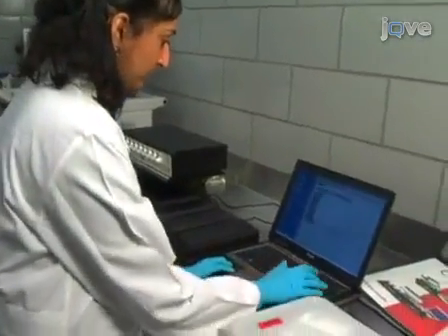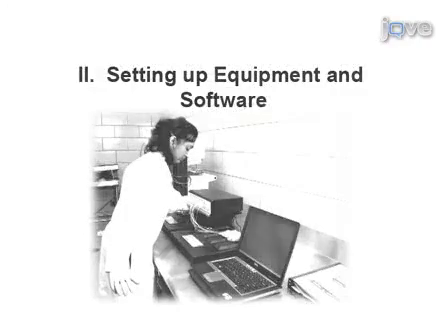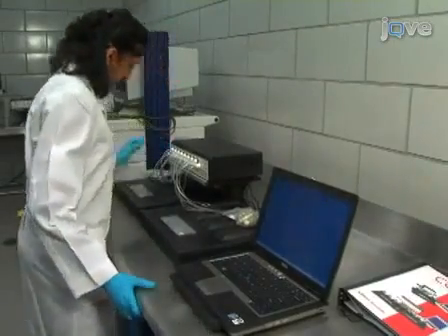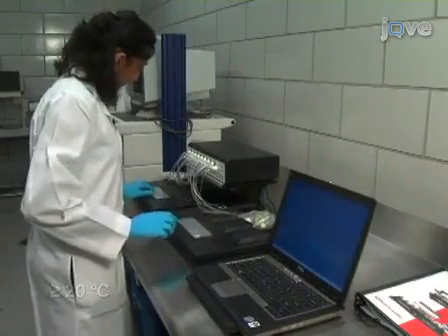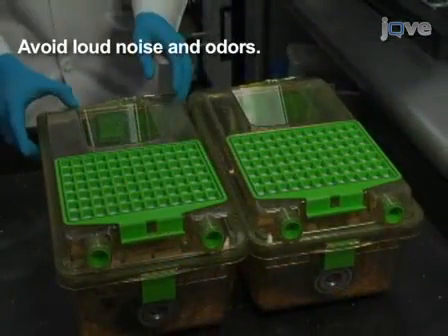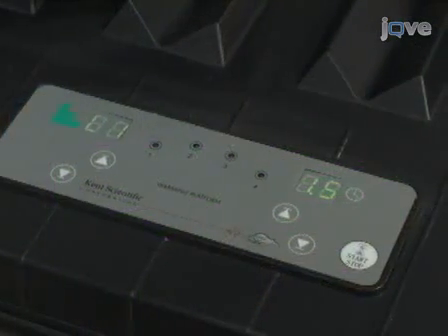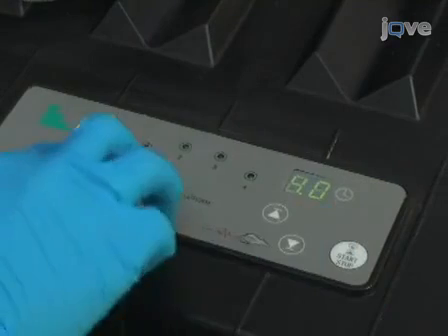So, let's get started. To set up the CODA system, select an area in the lab where the room temperature is a stable 20 degrees Celsius or above. Avoid locations near air conditioning vents. Exposing animals to loud noise or odors may irritate or stress the animal. Odors can include any strong perfume that you may be wearing. Turn on the CODA controller and then warming platforms, which are set to level 3.